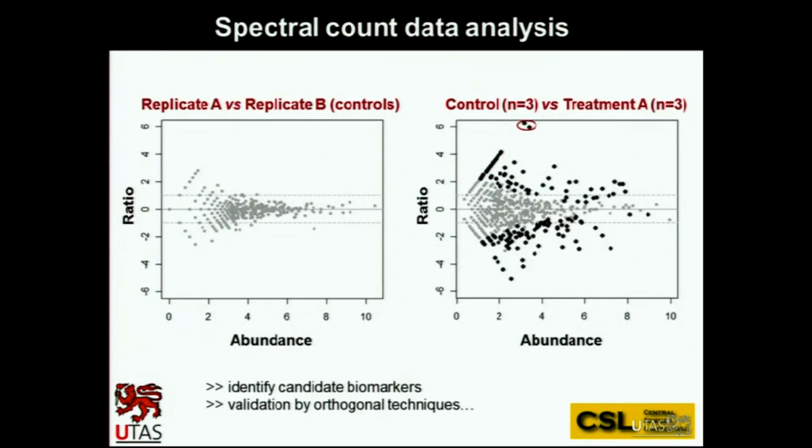And of course, once you've identified the proteins in one particular sample, the idea is to compare it to others, and so there are a number of statistical methods you can use for count-based data that take into account the consistency between replicates and also the absolute values. So you get more robust measurements when you have more counts being recorded.